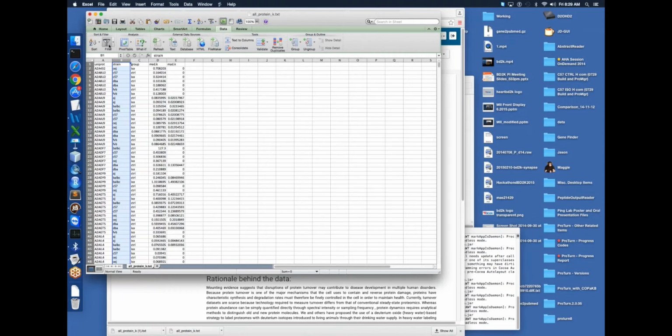I have not read the manuscript, so my question may be naive. But you provide a metadata file for all the data that you can search, and identify what are actually the raw data that you need for your specific question. Is that correct? Right, that's correct. Okay. All right.